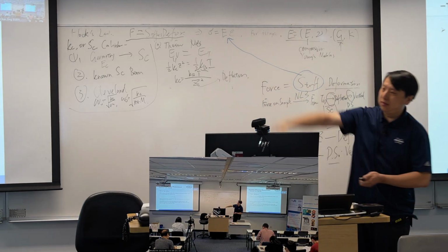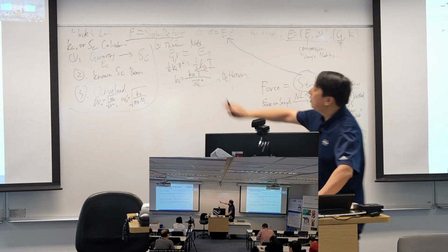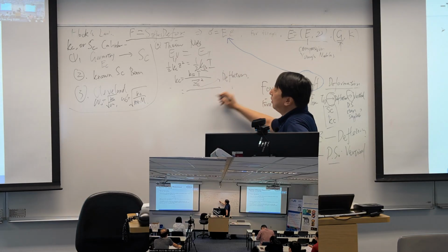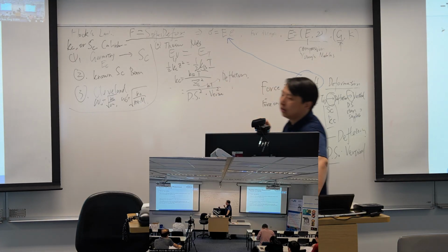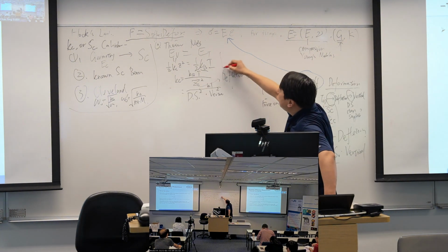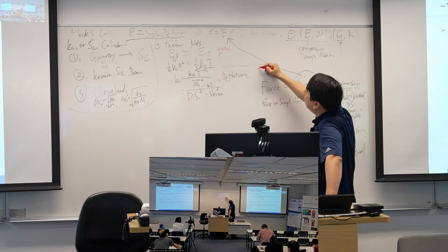Our beam vibrates, which means its deflection oscillates, and this deflection Z can be written as the deflection sensitivity times the vertical change. So to get this done, we need to monitor the vertical change at this temperature.